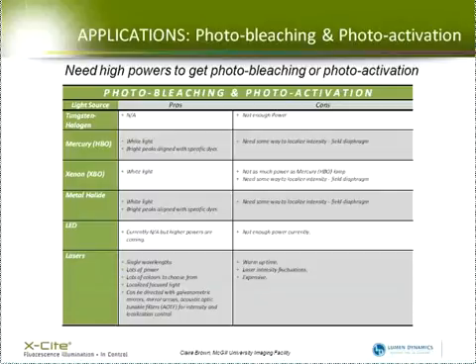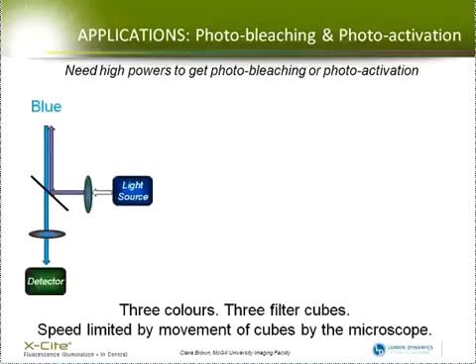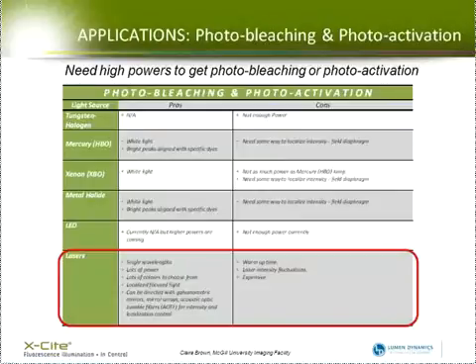For photobleaching and photoactivation, the main issue is that you need high power, and the power needs to be focused and concentrated. So lasers are really the best choice for that, because you can focus the laser into a small spot, and you can use acousto-optic devices to turn the laser on and off and do pattern photobleaching or pattern photoactivation. The LEDs right now don't really have enough power to do a lot of photobleaching experiments, but they're continually working on the technology and getting higher and higher power sources.